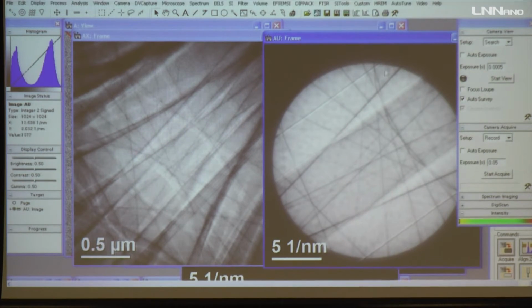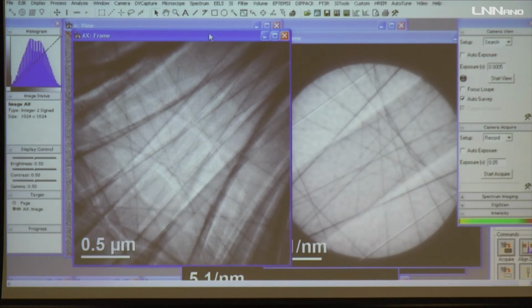You're quantifying these Holz lines, because as I said, these lines are related to the crystal lattice. They are very sensitive to any strain fields, accelerating voltages, or any defects in your sample. As the visibility is really very good here, the quantification is much easier compared to here. So if you want to quantify, use this technique. If you want to visually see how the Holz lines are behaving, use this technique.